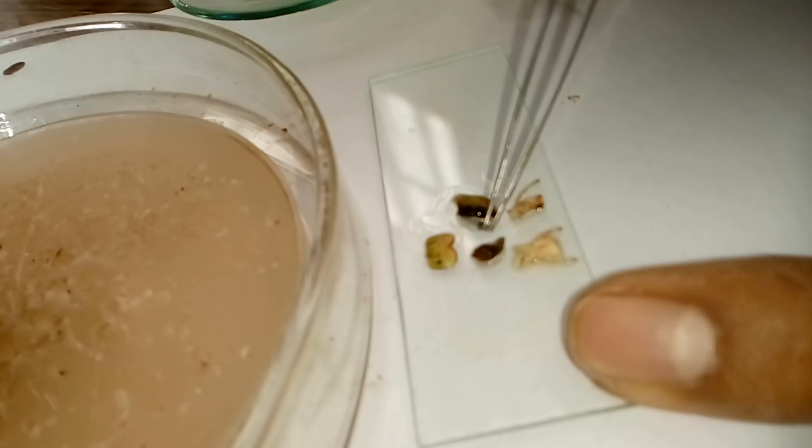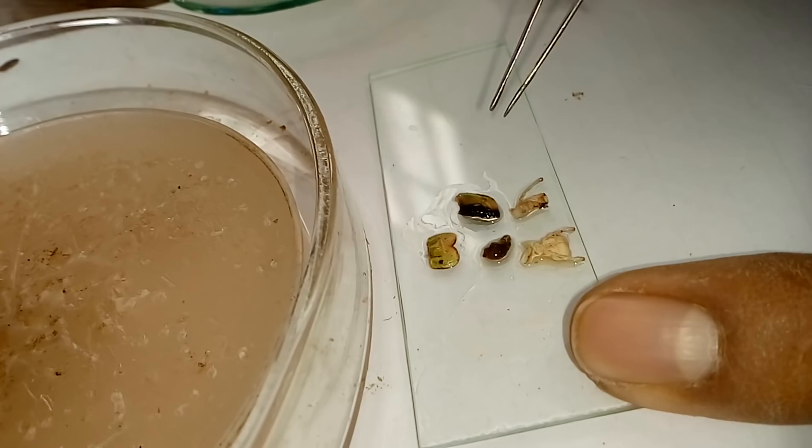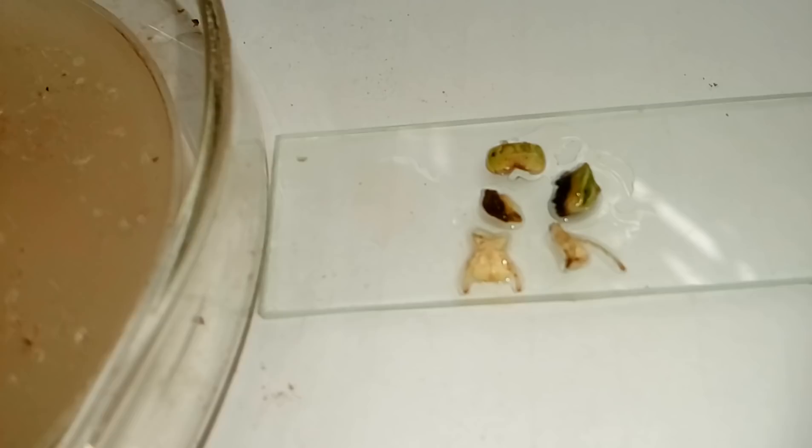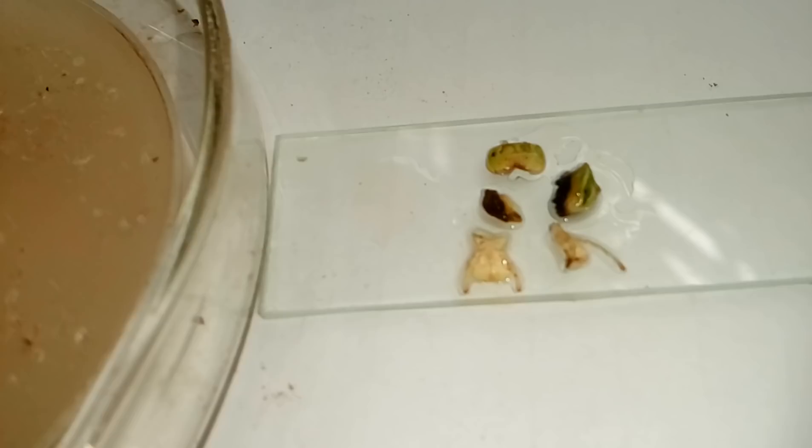This is our hypopharynx. In general it looks like a tongue of grazing animals — same as in the case of grazing animals, the hypopharynx is also similar in structure in the case of grasshoppers, having a lot of spines. So these are our typical mouth parts of a grasshopper: labrum, mandible, maxilla, labium, and hypopharynx.